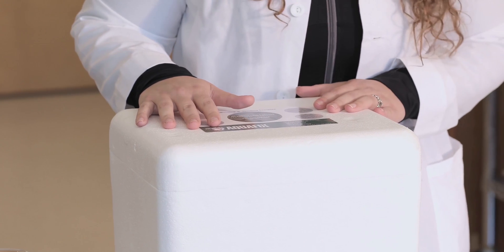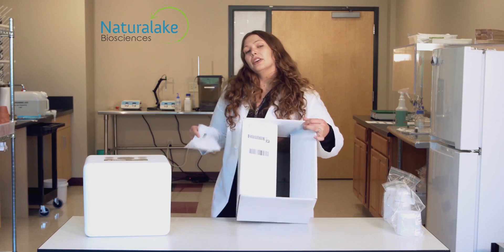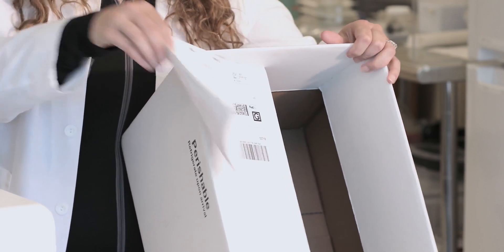Send your sample kit to the provided address. Use UPS or FedEx to send next day. If sending your sample in your own cooler or containers, they will not be returned to you. If sending your sample in the box provided, make sure to cover up the label with your own label.